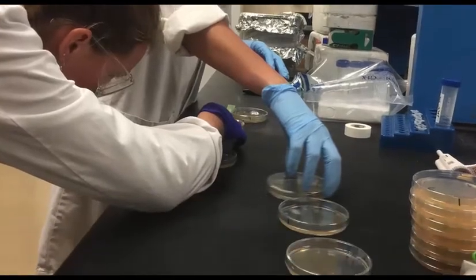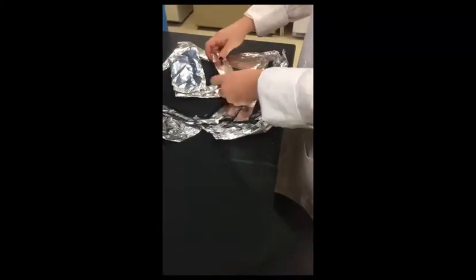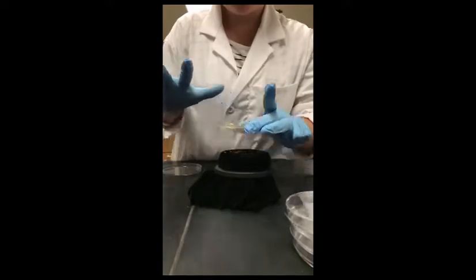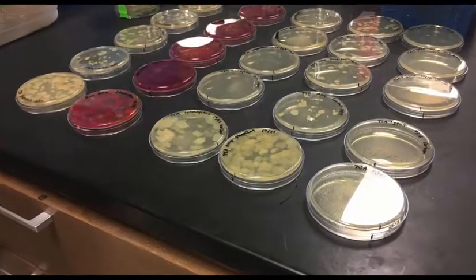This method allows us to use velvet to create a stamp in order to create identical plates on selective and differential media. We replica plated this growth onto MacConkey agar to identify gram-negative lactose fermenters, a trait of fecal coliforms, our target bacteria, and plates with antibiotics in them in order to grow bacteria resistant to those drugs.